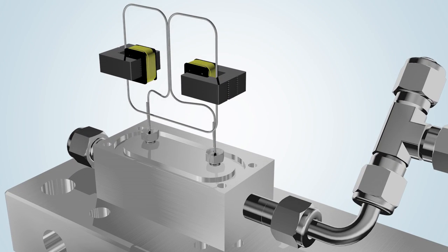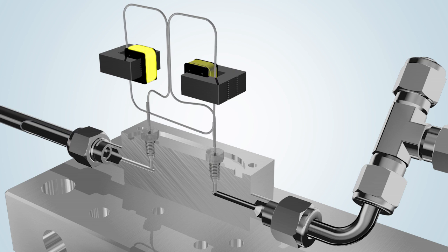Once the power source is connected, the sensor tube immediately begins to vibrate. This vibration, which has been slowed down considerably in the video, is generated by energizing two actuators alternately.